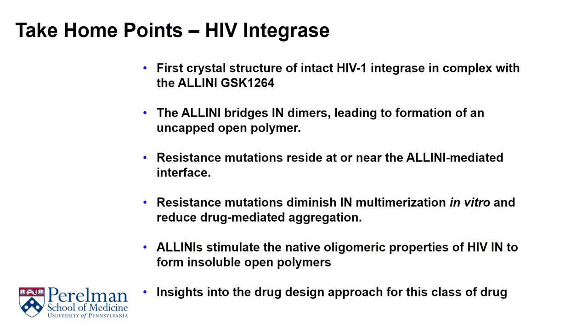With regards to HIV integrase, today I told you about the first crystal structure of an intact HIV-1 integrase in complex with the ALLINI GSK-1264. In our structure, the ALLINI bridges integrase dimers, leading to the formation of an uncapped open polymer. Resistance mutations reside at or near the ALLINI-mediated interface.